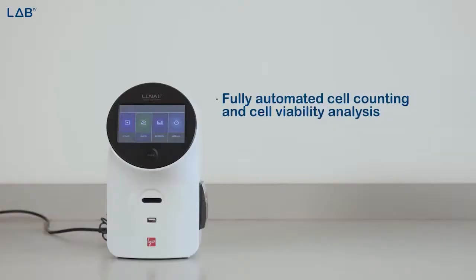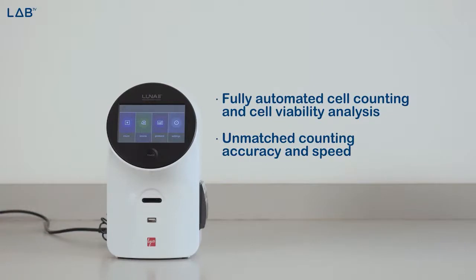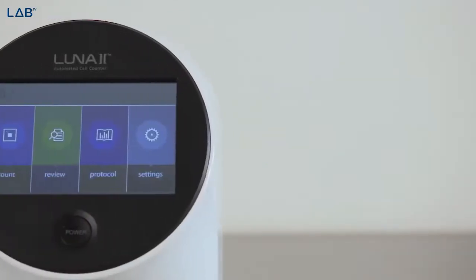Fully automated cell counting and cell viability analysis. Unmatched counting accuracy and speed. The most affordable running costs.